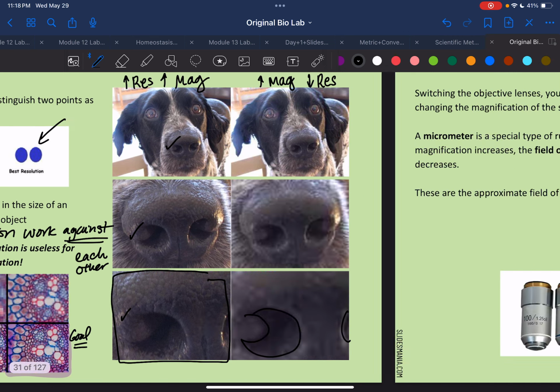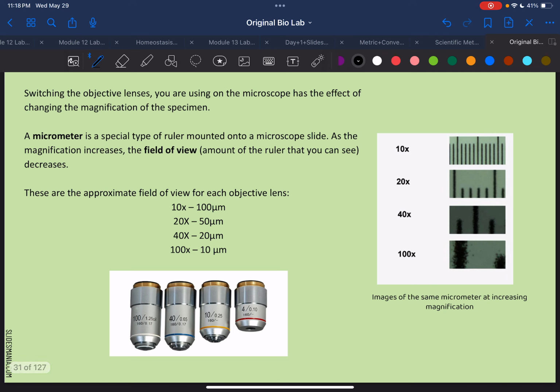So we're going to talk a little bit about how the microscope uses its sizing, because that's the thing that we have to learn and focus on in this virtual environment. So you're just going to pretend as if another scientist took the pictures of the microscope, but you are the one that needs to analyze the image, right? So that is just the story. That is your job in our little story that we're working on.